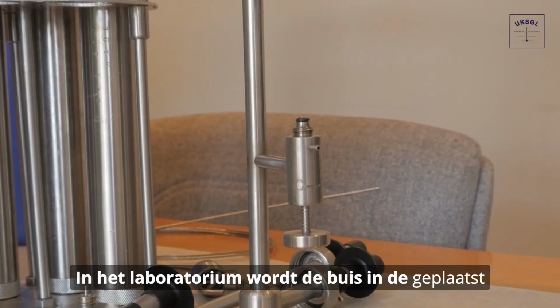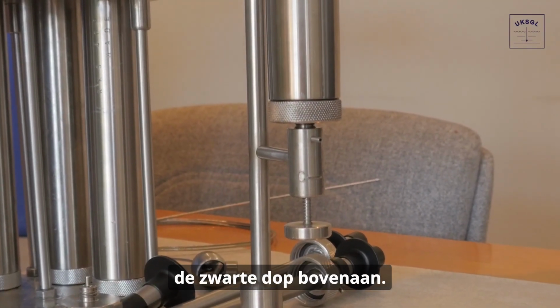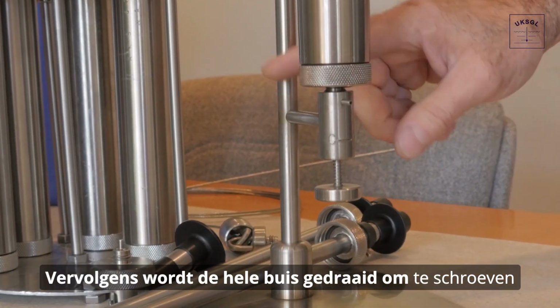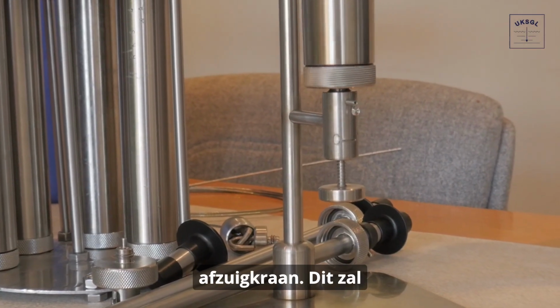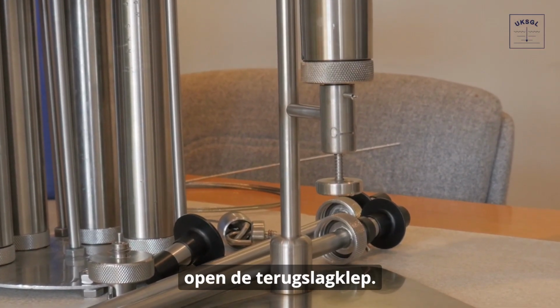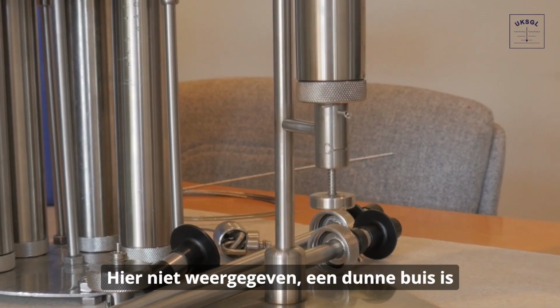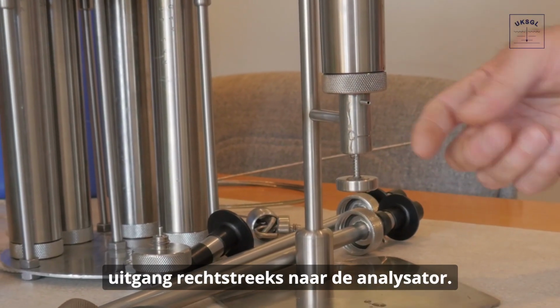At the lab, the tube is placed in the liquid extractor with the black cap at the top. Then, the whole tube is rotated to screw the bottom non-return valve onto the extractor spigot. This will open the non-return valve. Not shown here, a thin pipe will be connected from the spigot outlet directly to the analyzer.